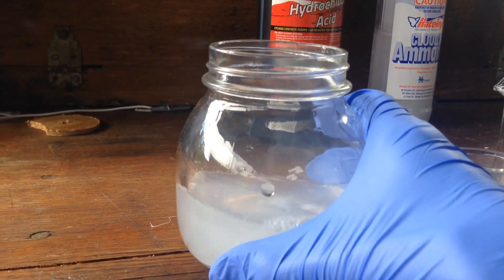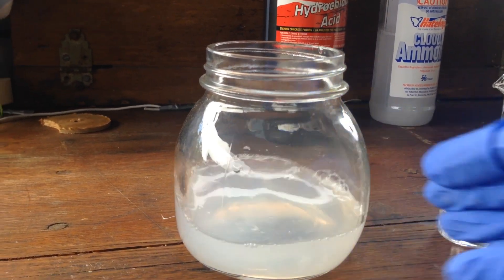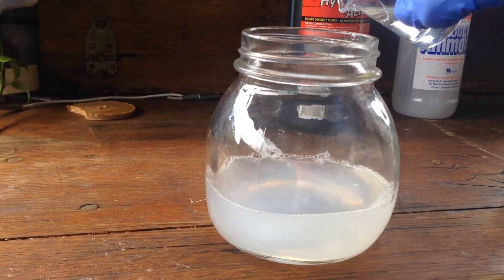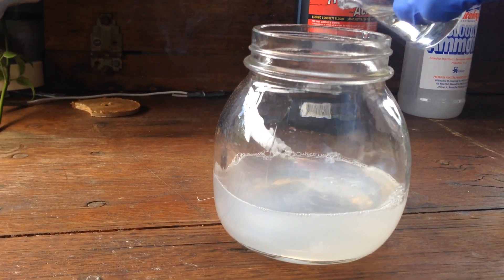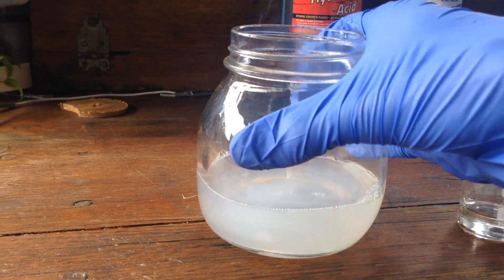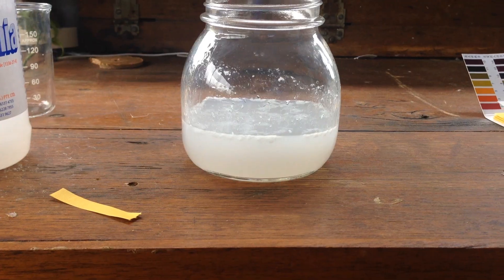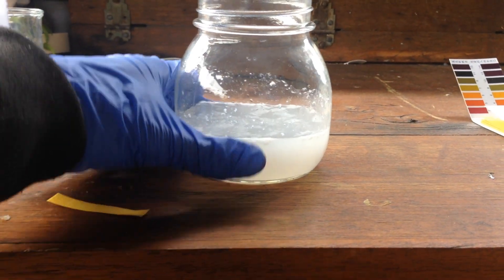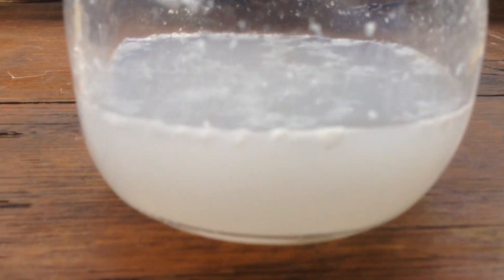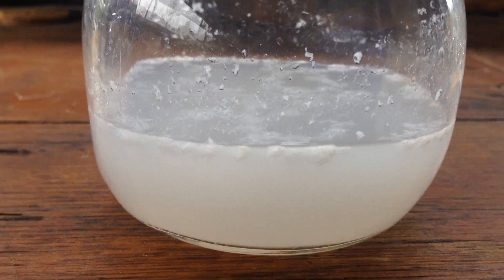It should actually start to warm up as well if we mix it around. Yeah, that's starting to get a little bit warm, but we'll slowly add some more acid. Now that the reaction's finished, the water has heated up quite a bit, and you can probably see just on the top there — I think that's our ammonium chloride precipitating out of the solution.